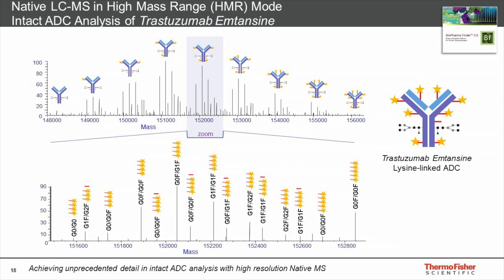Again, I haven't deglycosylated the sample, but I've done now no sample prep. I've introduced it straight. We desalted online. And now I have all these glycoforms. And I can actually make use of this information.